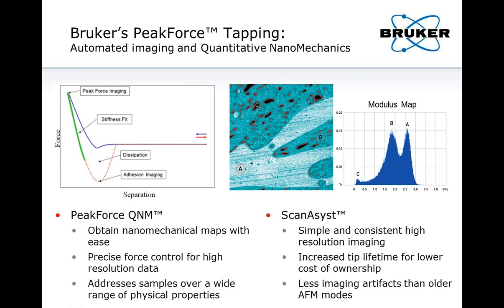So in the beginning, nothing is going to happen. Your cantilever is not going to get deflected because your tip simply doesn't see any interaction between itself and the surface. And then at one point, there will be some attraction, so the cantilever will bend downwards, as we can see on the curve here. And then the tip contacts the surface, and the cantilever bends up. And then when we pull back, quite the opposite happens. The cantilever bends the other way, and at one point, the attractive forces between tip and sample are overcome by the spring force, and the cantilever simply jumps back into its original position.